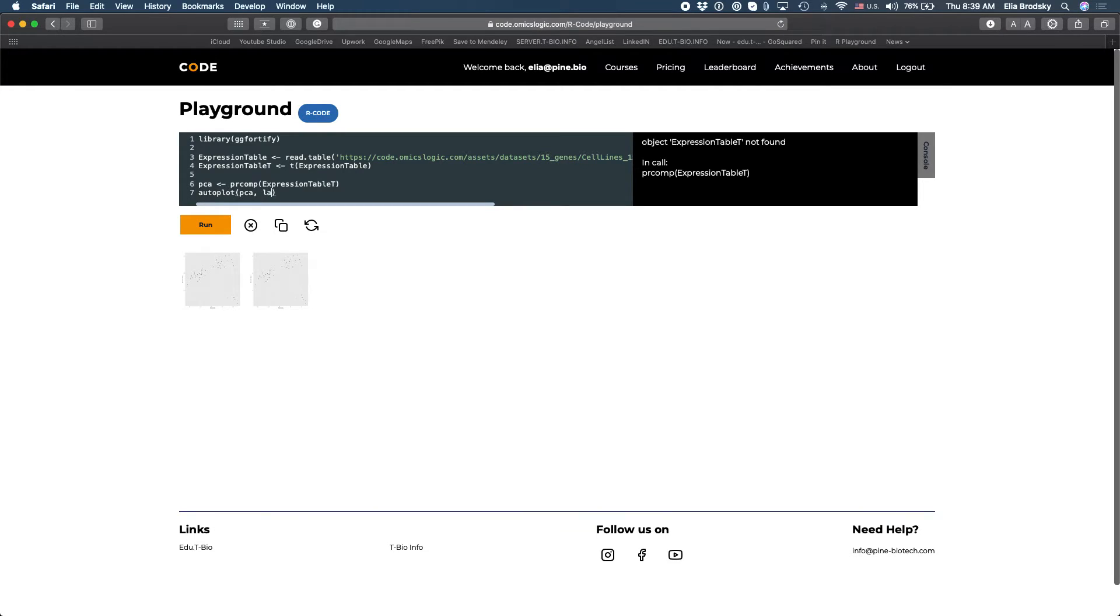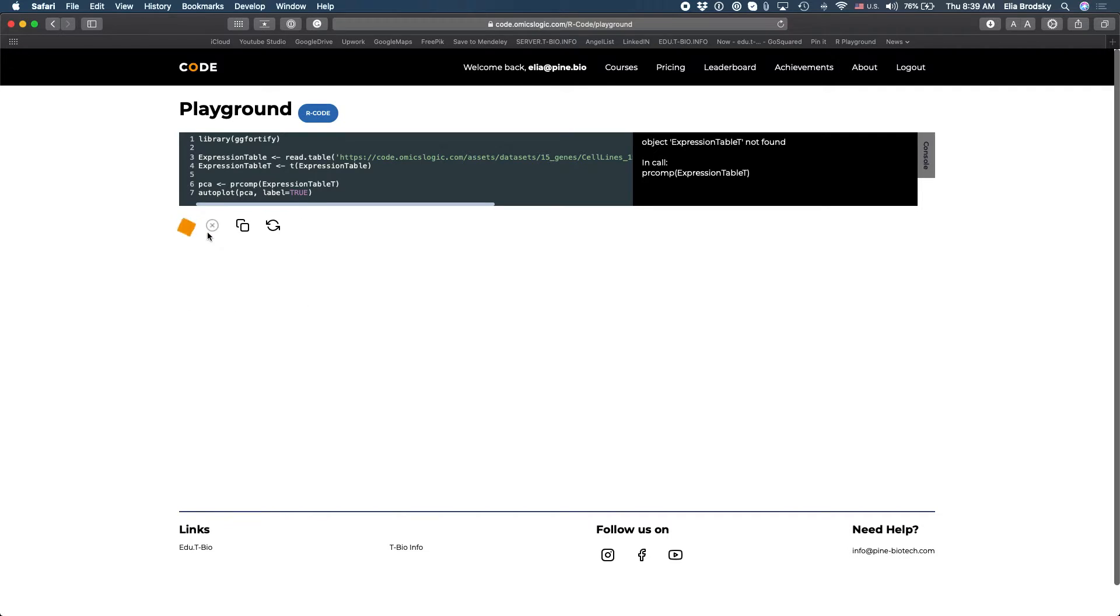So first of all I can add here label equals true and that will label the data for us.